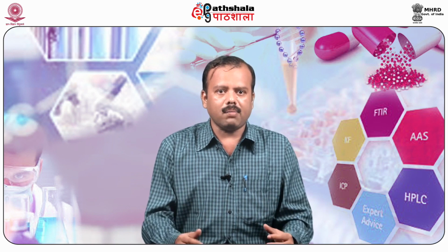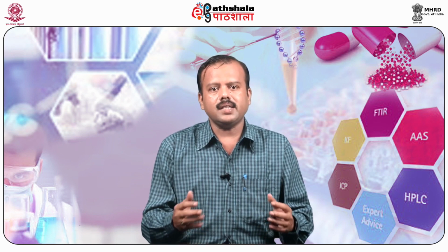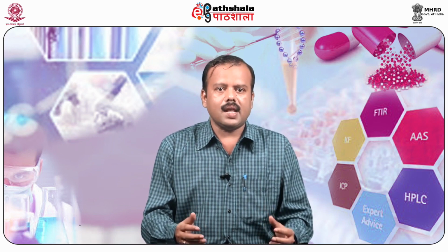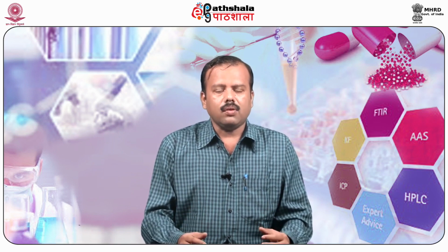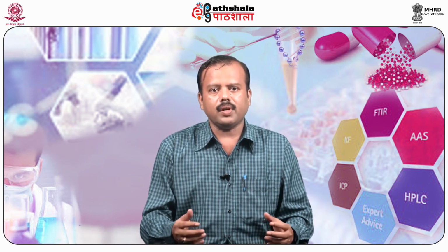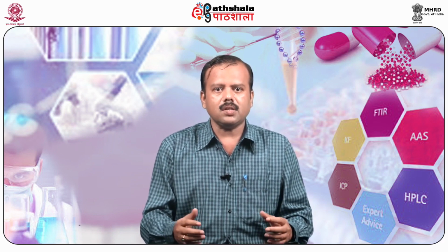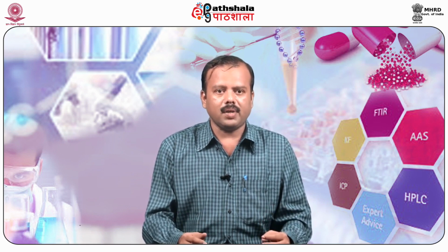The metabolite determinations, that is the concentration of the primary metabolites and secondary metabolites, also indicate microbial growth. Optical density of the microbial cells at 620 nanometers is also an indicator for microbial growth. The higher the optical density, the more microbial growth, whereas lower optical density means lower microbial growth, which is measured by using a nephelometer or a spectrophotometer.